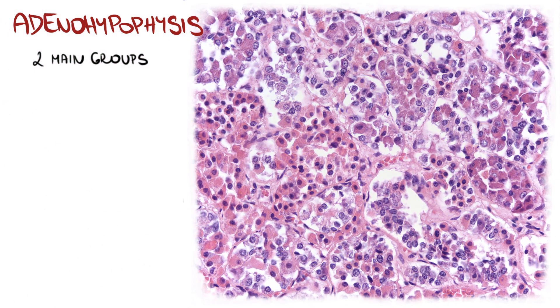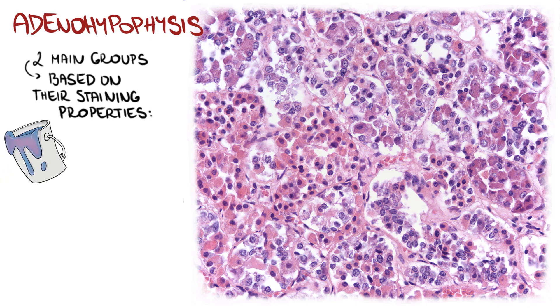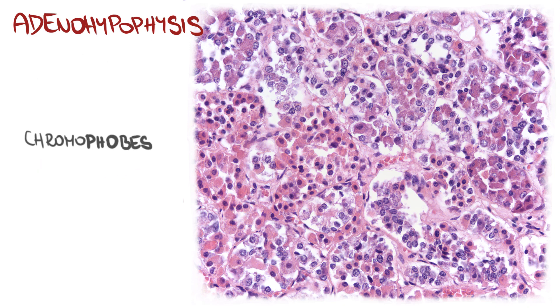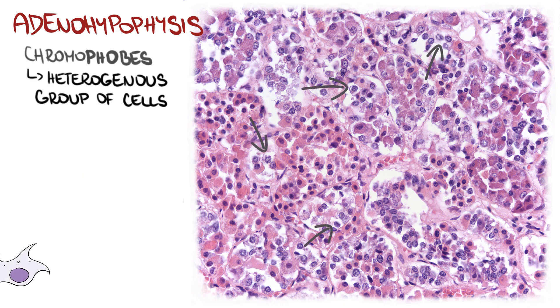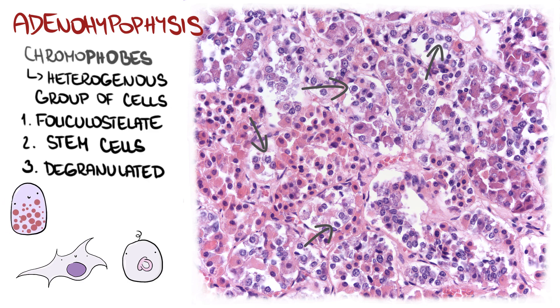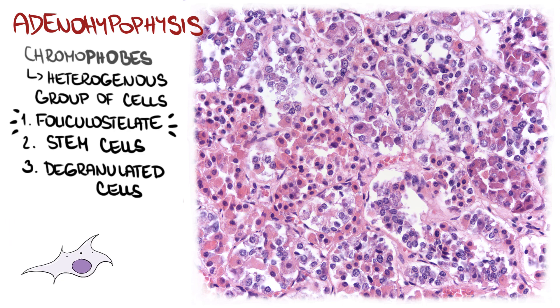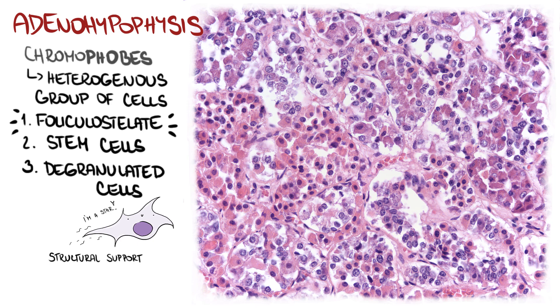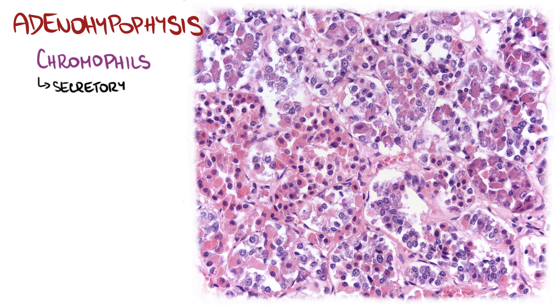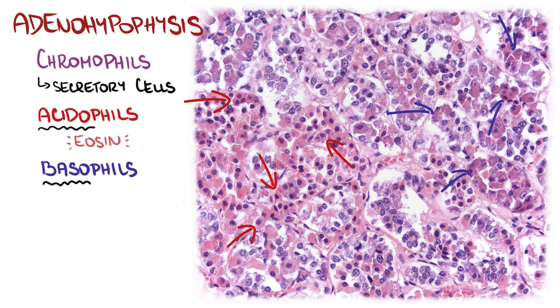There are two main groups of epithelial cells in pars distalis, and the division is based on their staining properties. The ones that stain weakly are called chromophobes, and the ones that absorb the dye readily are called chromophils. Chromophobes represent a heterogeneous group including folliculostellate cells, stem cells, as well as degranulated cells which have already released all their secretory granules. Folliculostellate cells are the most numerous representatives of chromophobes and form a network providing structural support to hormone-secreting cells. Chromophils are secretory cells subdivided into acidophils, stained by acidic dyes such as eosin, and basophils, stained by basic dyes such as hematoxylin.